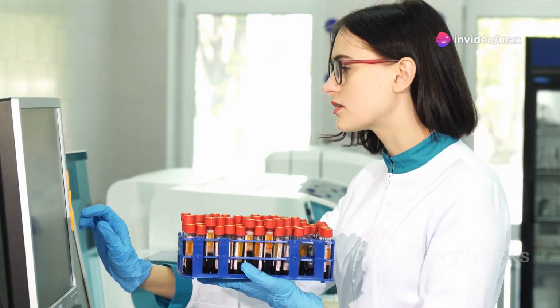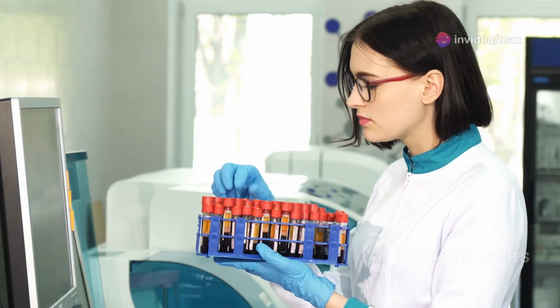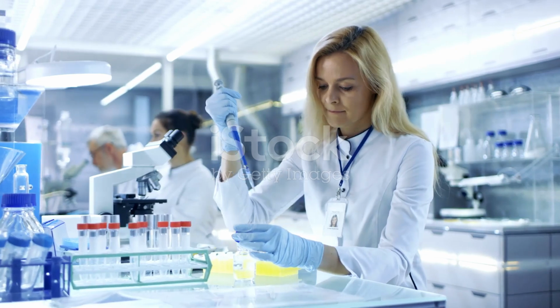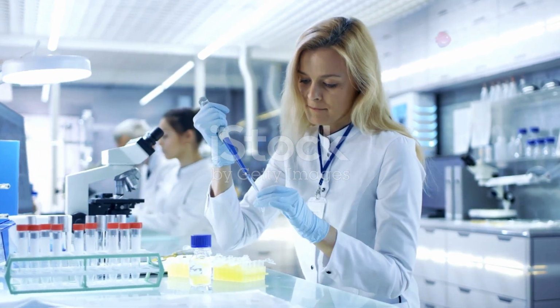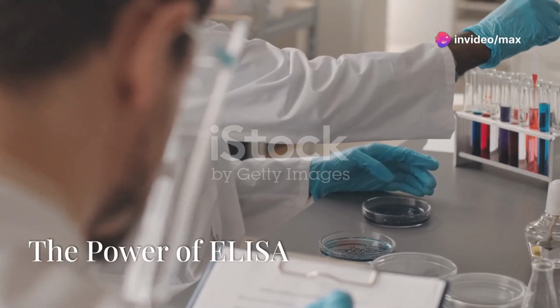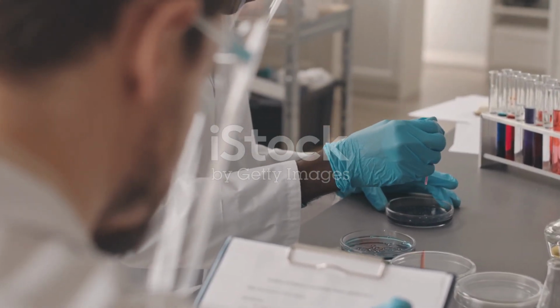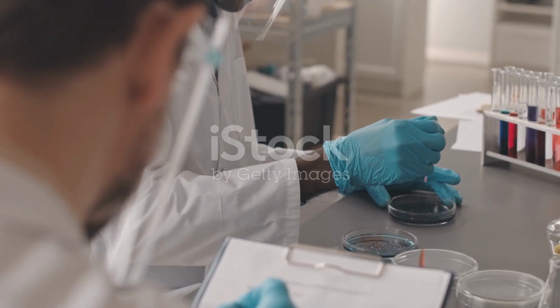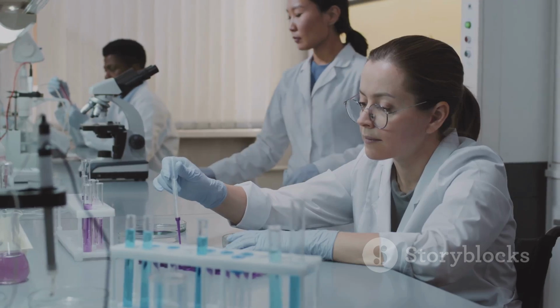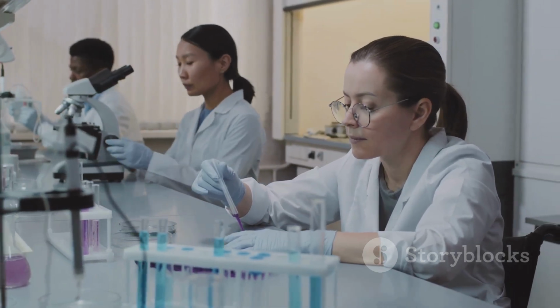Indirect ELISA, on the other hand, uses a primary antibody that binds to the antigen, followed by a secondary enzyme-linked antibody that binds to the primary antibody. This method increases sensitivity and flexibility, though it can be more time-consuming. ELISA is a powerful tool in diagnostics and research, offering high sensitivity and specificity. Its versatility allows for the detection of a wide range of antigens and antibodies, making it indispensable in many scientific and medical applications.